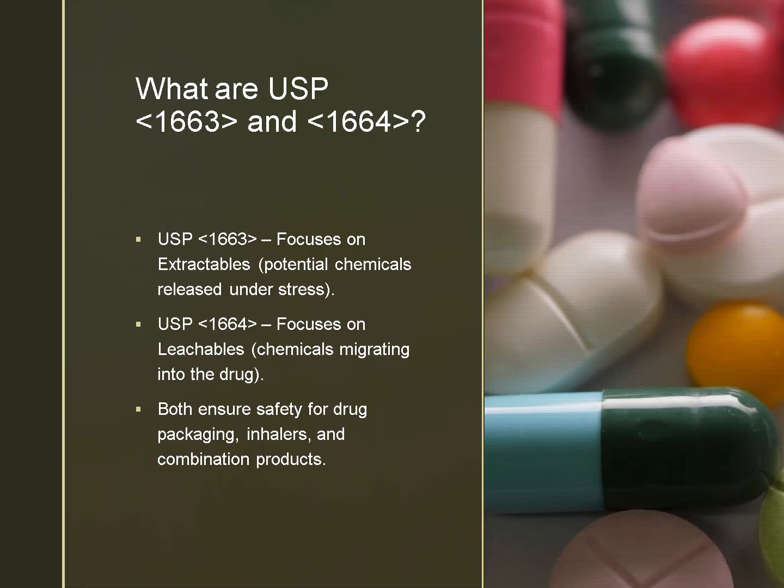USP 1664, on the other hand, is all about leachables, substances that actually migrate into the drug during real-world use or storage. Together, they form the backbone of chemical safety evaluation for drug packaging, inhalers, syringes, and combination devices. Following them doesn't just help you pass audits, it proves your product is built on patient safety and global compliance.